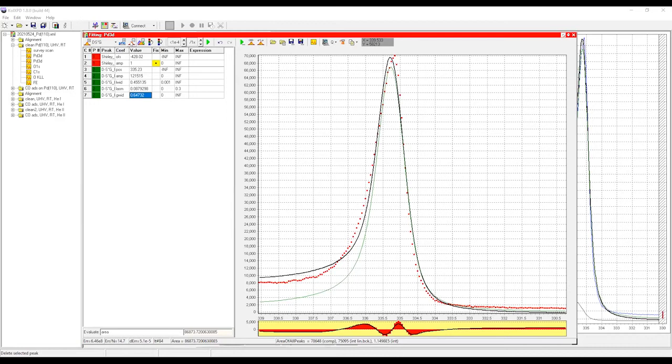Because we need a very focused beam, with a size of several hundred microns, the X-ray source also has to be very small. So the anode is bombarded by a very focused electron beam. Usually you just evaporate the aluminum, make a hole there, and then the signal is quite low.